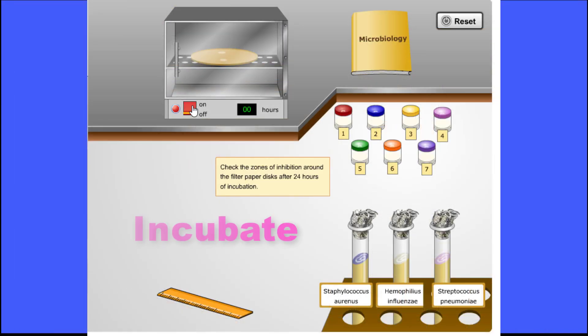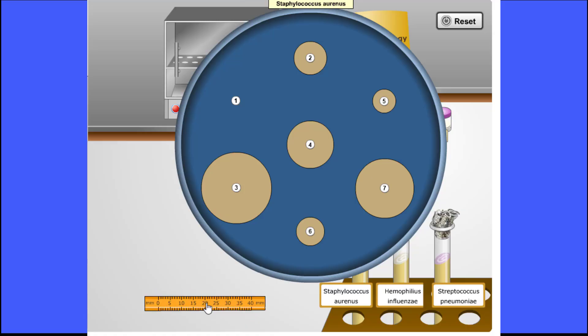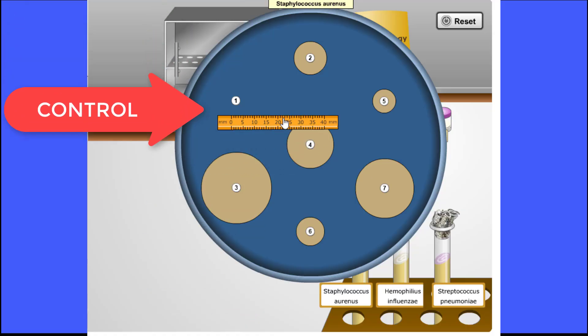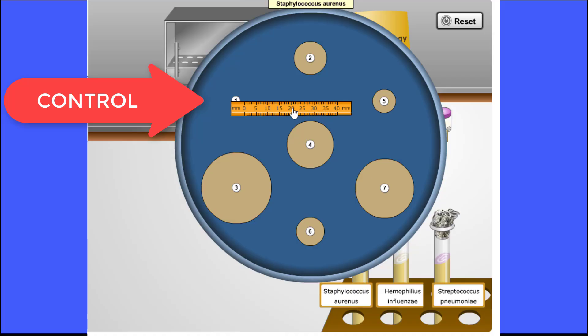Now we will incubate the petri dish. After 24 hours, we can remove our petri plate and measure the zones of inhibition. There is no zone of inhibition for number 1, which is our negative control, so that's good.